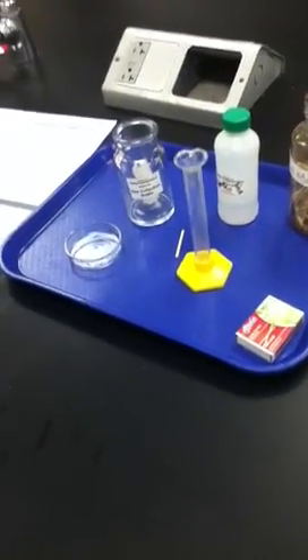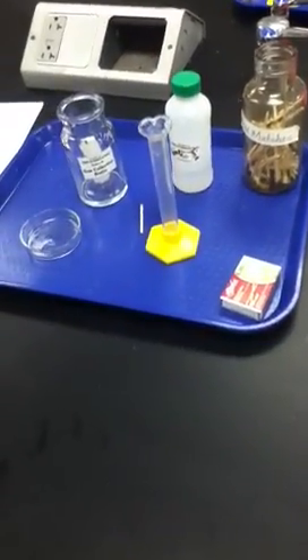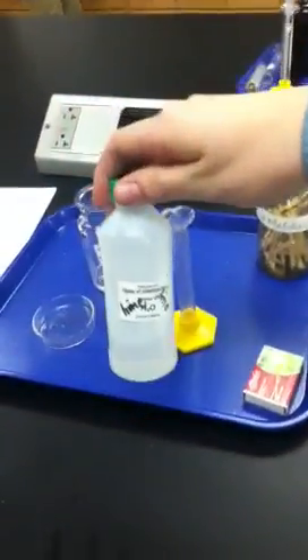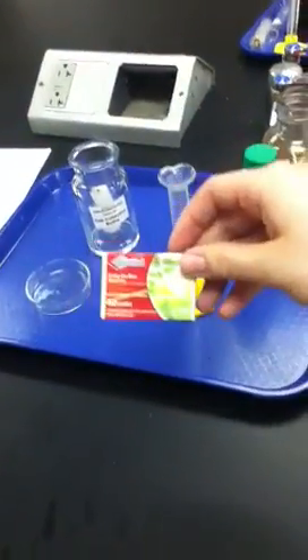Some laboratory skills that you need to do this are measuring a liquid and lighting a match so that it burns the candle properly.